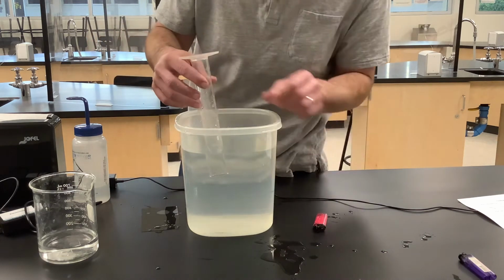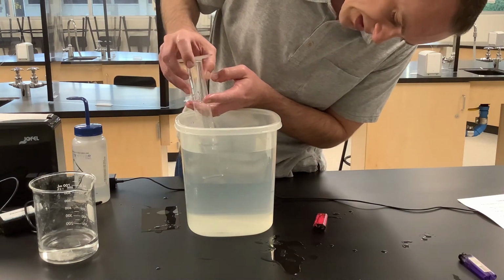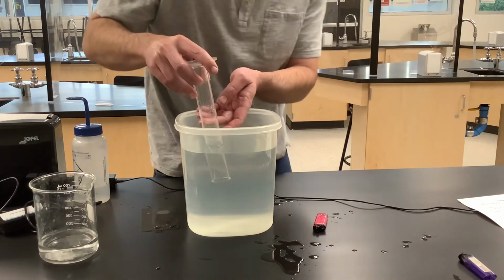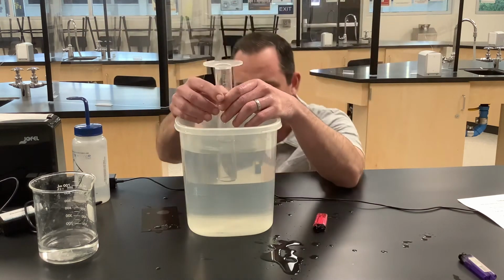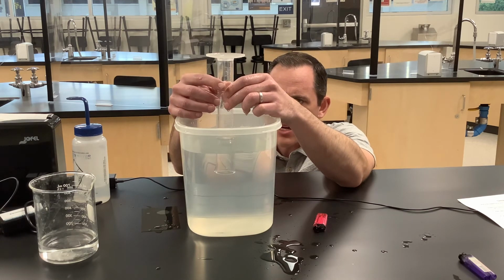All right, so what we want to do now is just try and read the graduated cylinder. You guys aren't going to have a very easy time of that, so I'll just read it for you. It's hard enough for me to read, to be quite honest. So we got to keep this thing kind of level. I'll just come down and read it from the side. I think that'll probably be easier. So we're at 80.